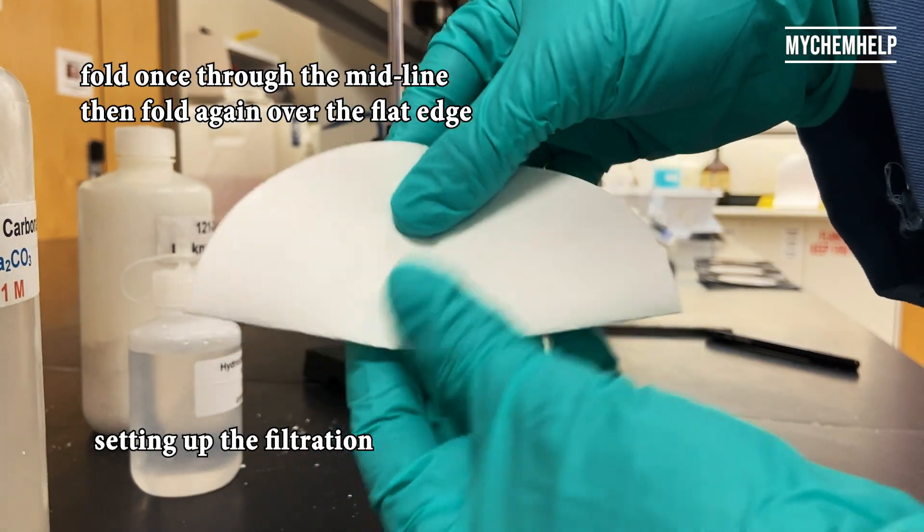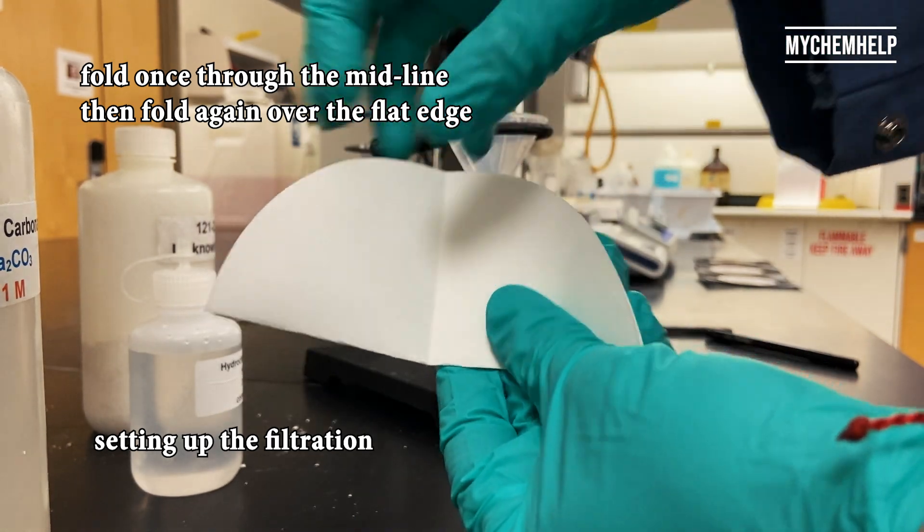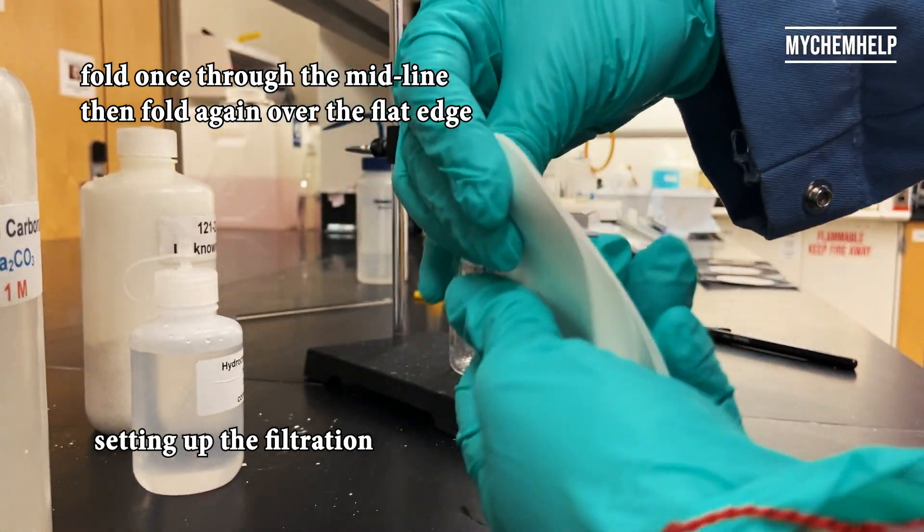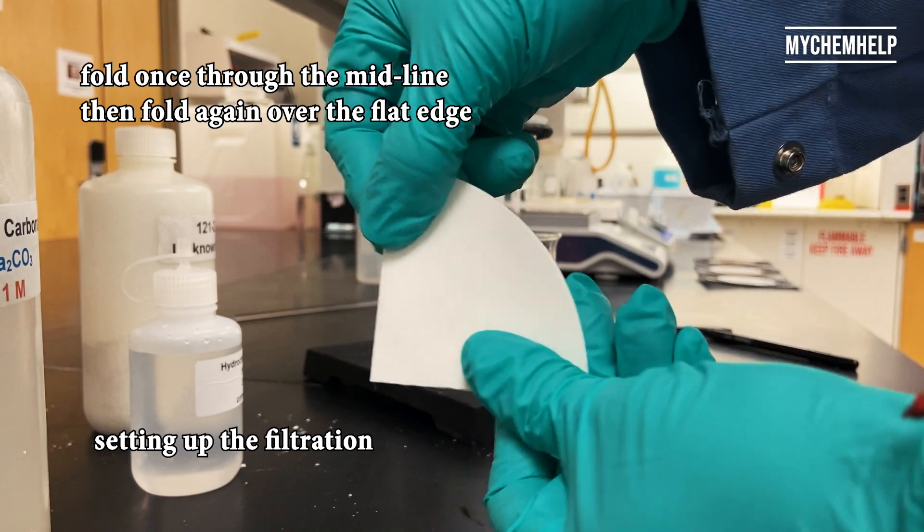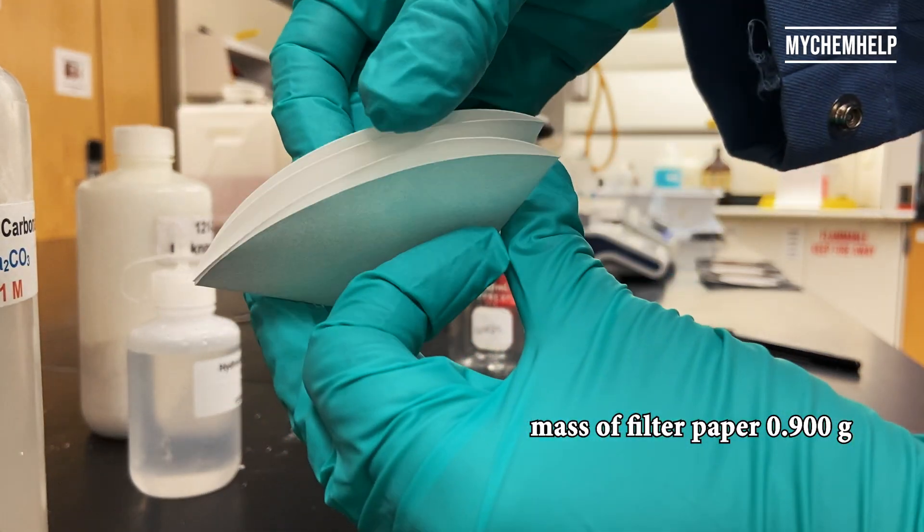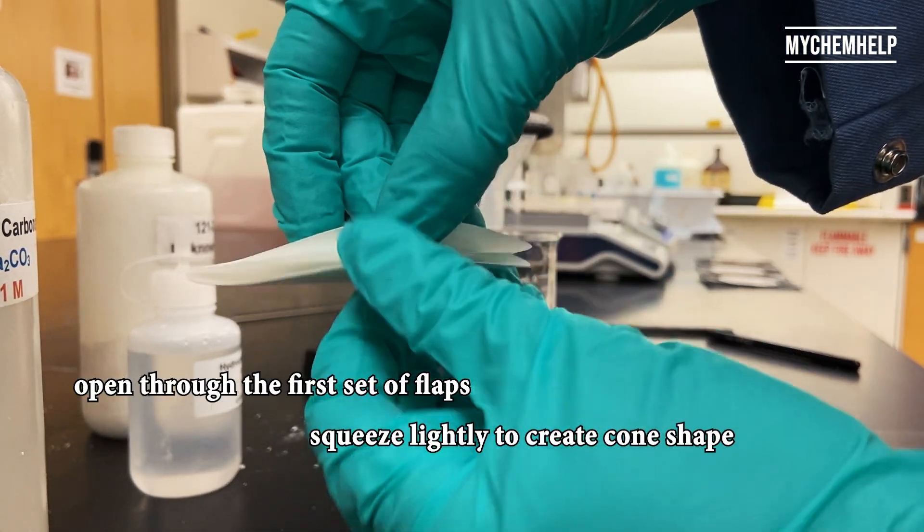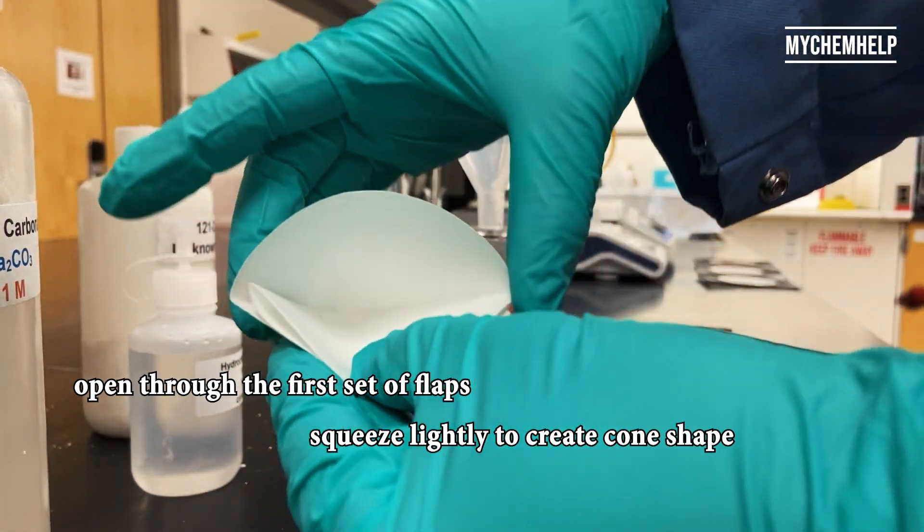So I'm setting up a filtration next, and I think the easiest way is just to fold the filter paper in quarters, and open through one of the first flaps, and just to create a little cone.